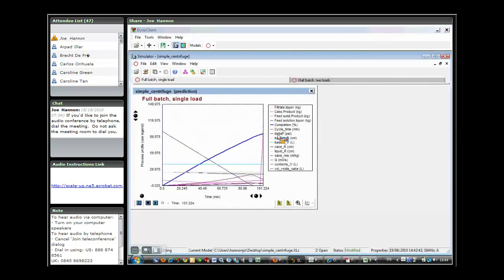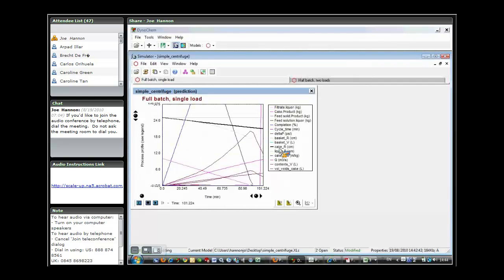Just to get a flavor for how that calculates, we use really mass balance equations to simulate, as a function of time, how the cake builds up.